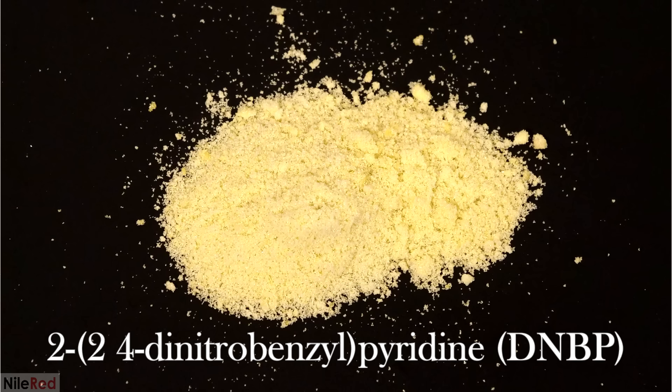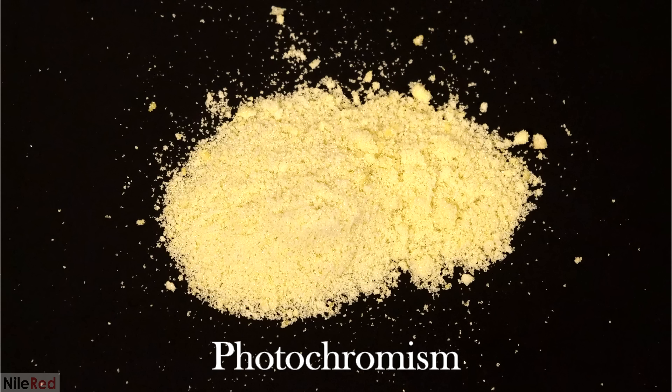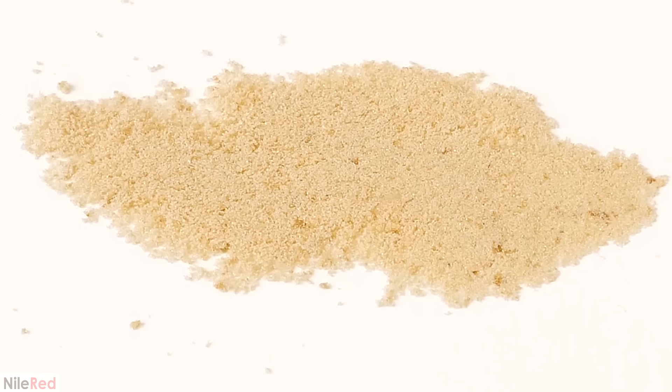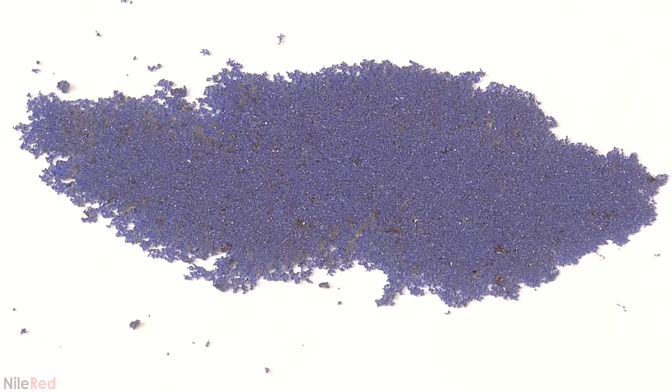Today I'll be making a chemical called 2-2,4-dinitrobenzalpyridine, or DNBP for short, which exhibits something called photochromism. This means that when it's exposed to light, it undergoes a reversible change in color. Under normal conditions, it's a brownish-yellow, but when it's exposed to UV or sunlight, it turns blue. Then if it's left in the dark for several hours, it slowly reverts back.